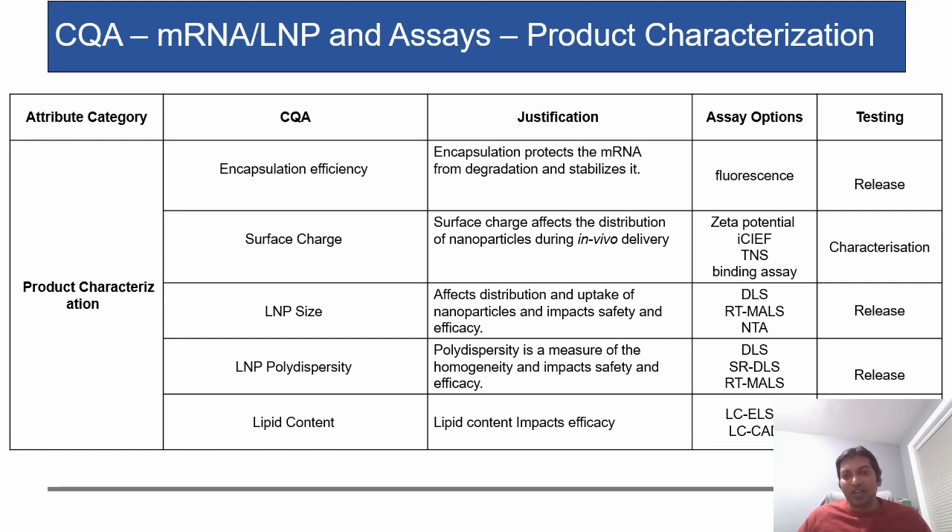And the lipid content, we've been talking a little bit about this, but from the product point of view, we have a specific lipid content. Normally we have an ionizable lipid and cholesterol. We just want to understand whether the same lipids we want to use to form this lipid nanoparticle are really present within the particle. So you ideally use LC based methods. ELSD and CAD are pretty much used for these, and these are release methods, so they have to be really well defined with all the LOQs, LODs, and the range of the method.